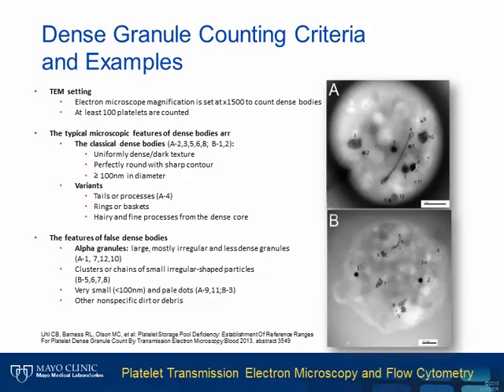Not every opaque object on whole-mount TEM is a dense granule. In collaboration with Dr. White, we first presented our dense granule counting criteria at the 2013 annual meeting of the American Society of Hematology. Dense granules should have uniformly dark texture, perfectly round and sharp contour, and greater than 100 nm in diameter. Larger, pale, and frequently irregularly shaped granules are likely alpha granules. Background chains and other non-specific opaque bodies should not be counted as dense granules.